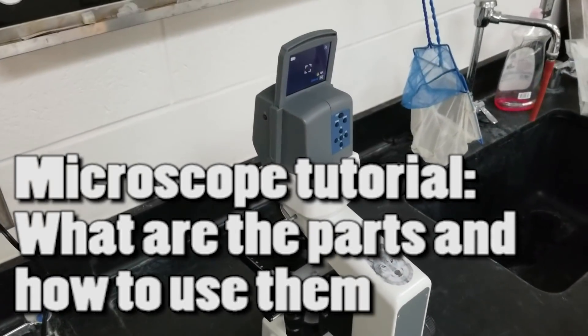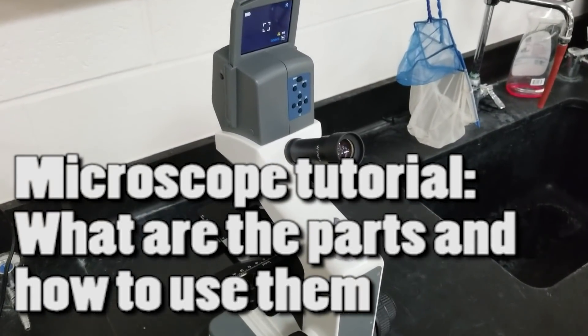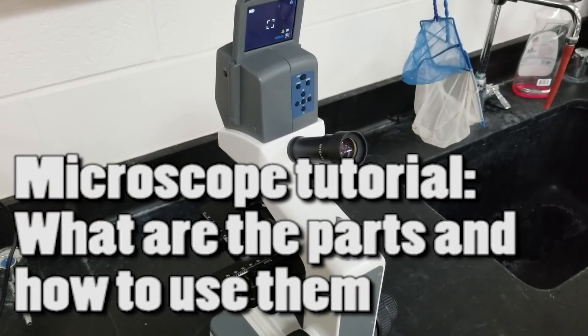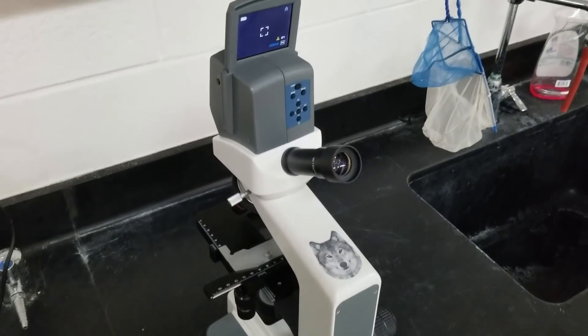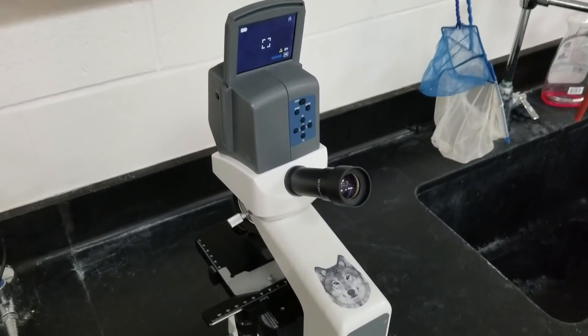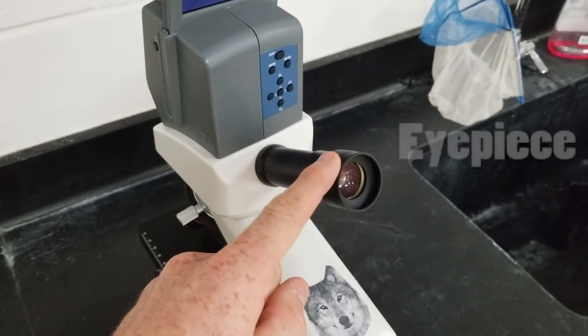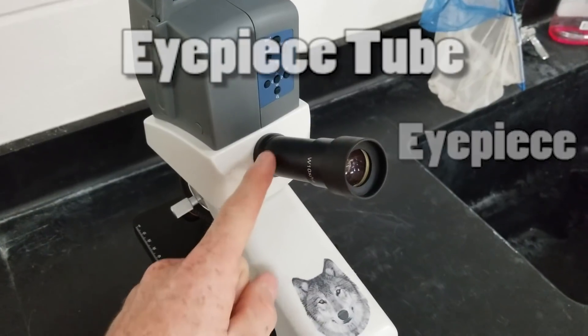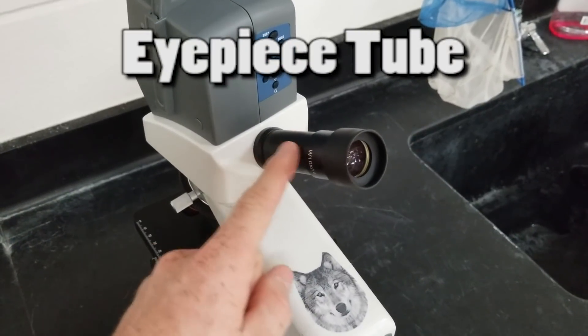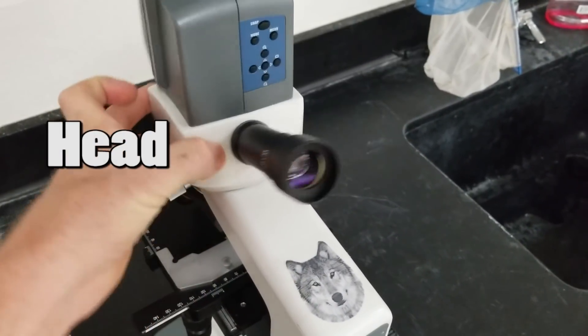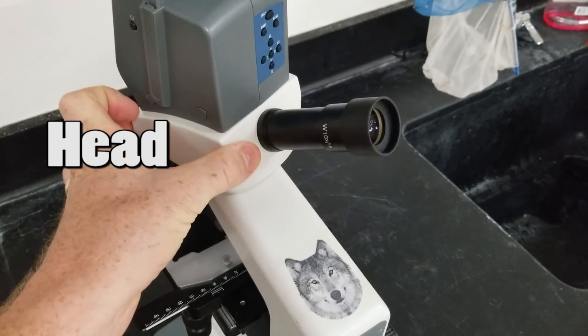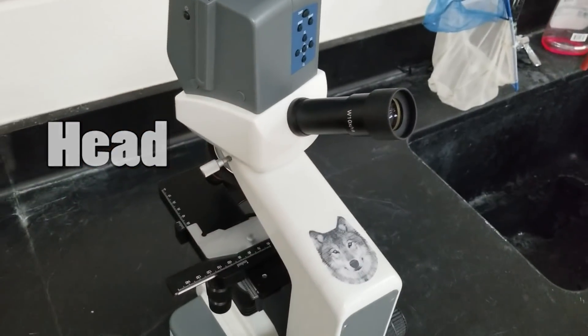Here is a quick rundown of the microscope parts and how to use the microscope. We'll start at the top. This is the eyepiece. The eyepiece has an eyepiece tube that connects down to the head. This is where you look in to see whatever is on your slide.